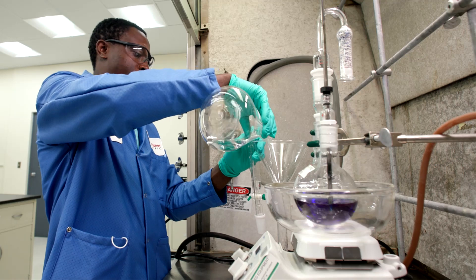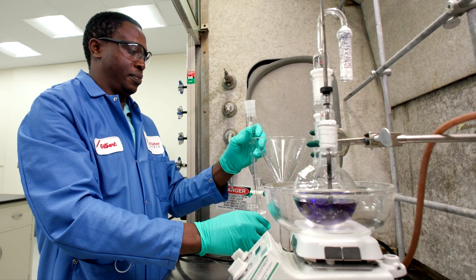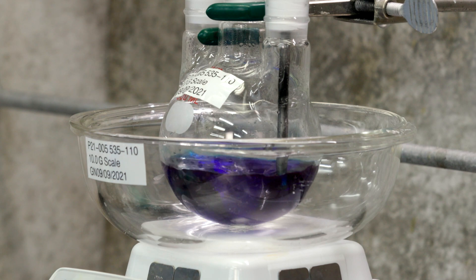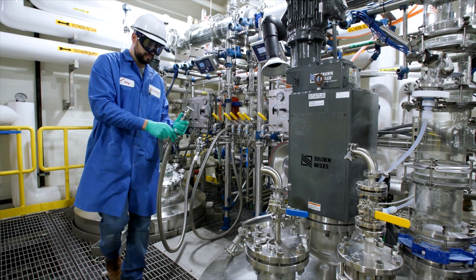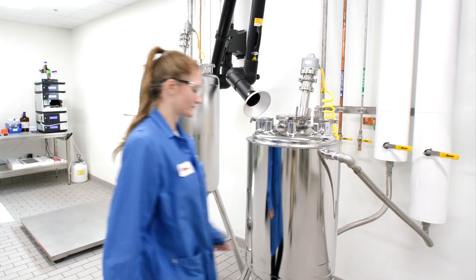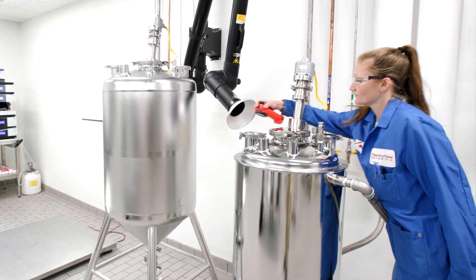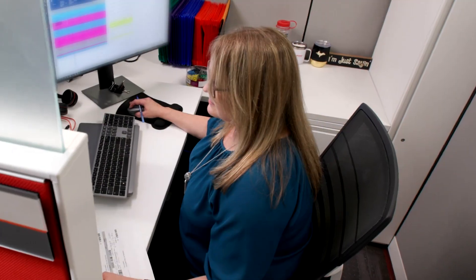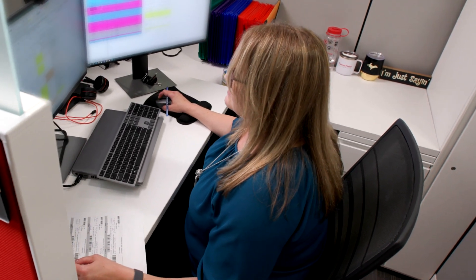Many of our standard phosphoramidites and modified nucleotides started as small-scale custom syntheses and were scaled up to manufacturing quantities through our robust project management and technology transfer processes.